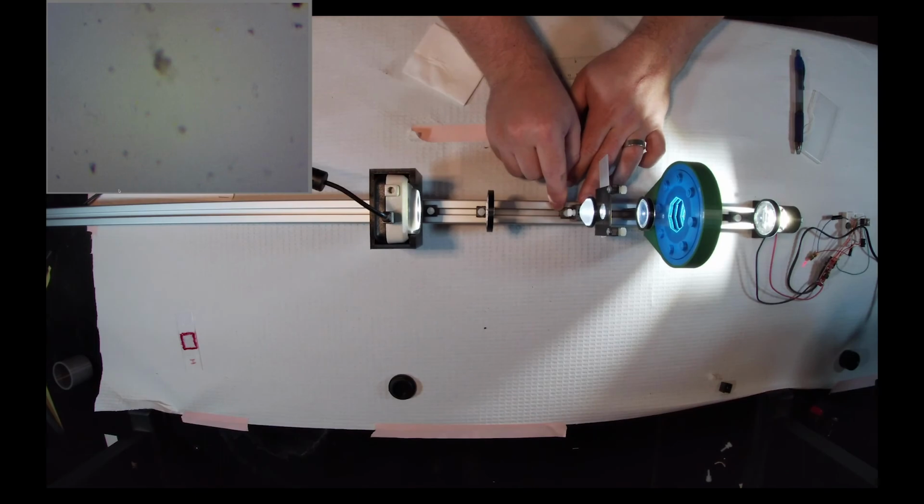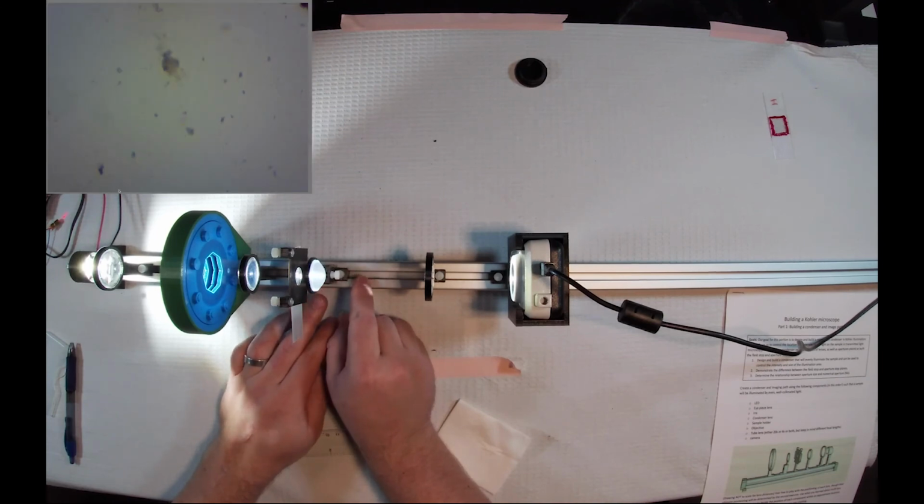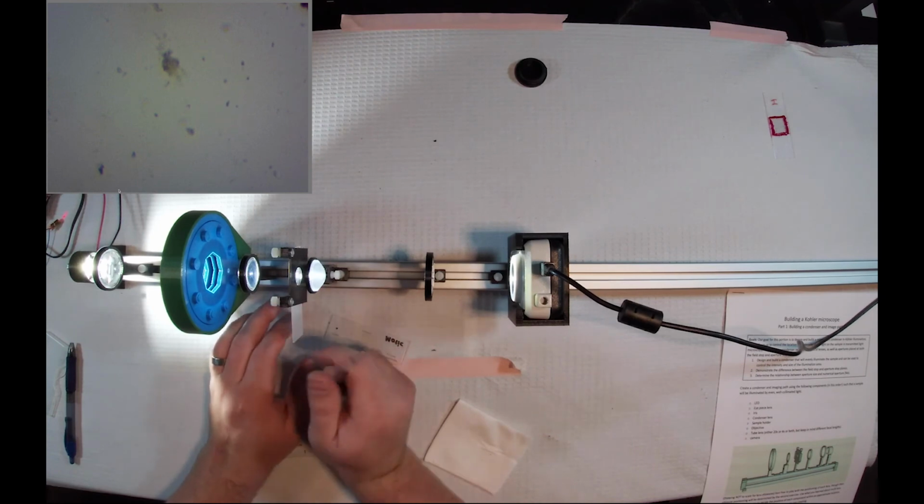Little Daphnia and Euglena. You can see a couple little swimmy guys. Pond water is always very interesting. There's lots of slowly decomposing matter. It attracts a lot of microbes, which then attracts a lot of protists. You can find maybe a bug or two sometimes.